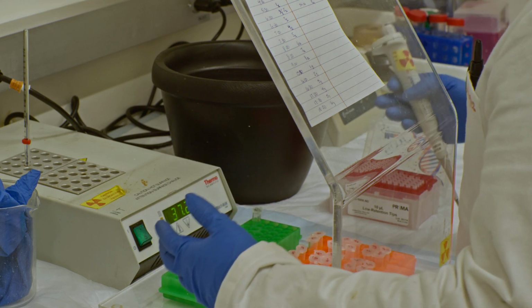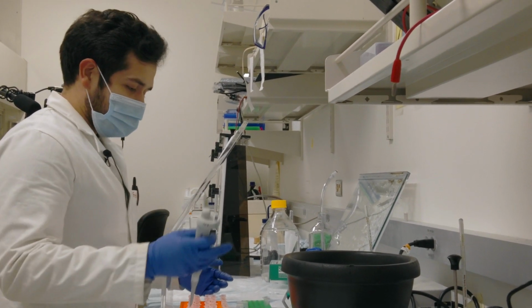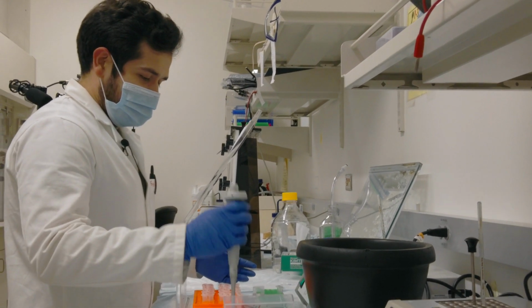Also, this kind of entails the same go around for the primer. If the primer isn't annealed to anything, it won't run on the gel other than staying at your time 0 whenever you collect that point during your experiment.